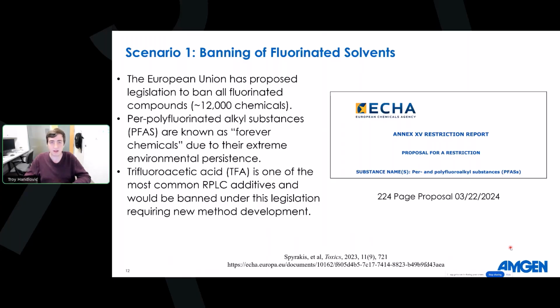And one PFAS that separation scientists use often, that they might not really think about as a PFAS, is trifluoroacetic acid. And this is one of the most commonly used and also most high-performing reverse phase liquid chromatography additives, especially in peptide and protein separations. So what we wanted to do is see, can we use the in-silico model to move from trifluoroacetic acid to something that would not be banned by such legislation if this legislation was to pass in the EU or potentially here in the United States.